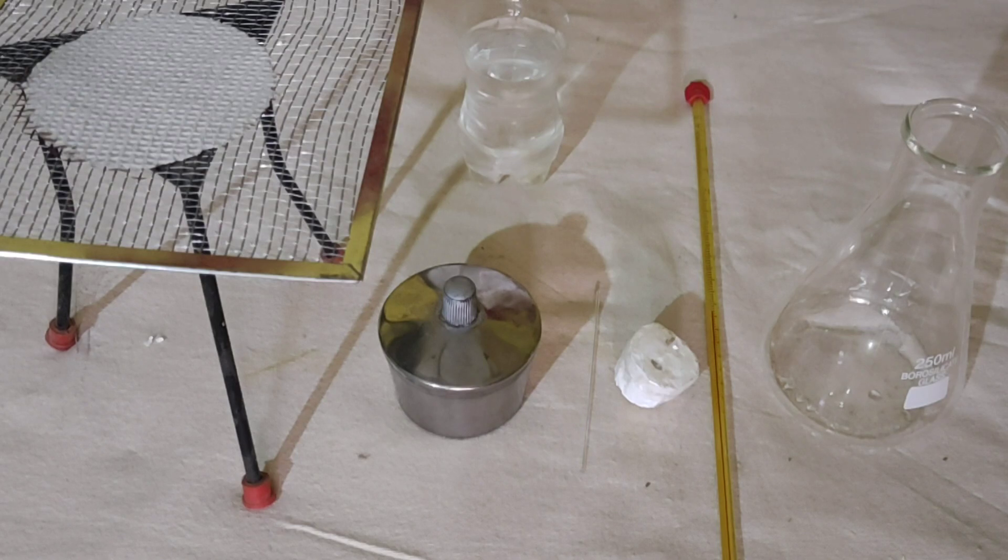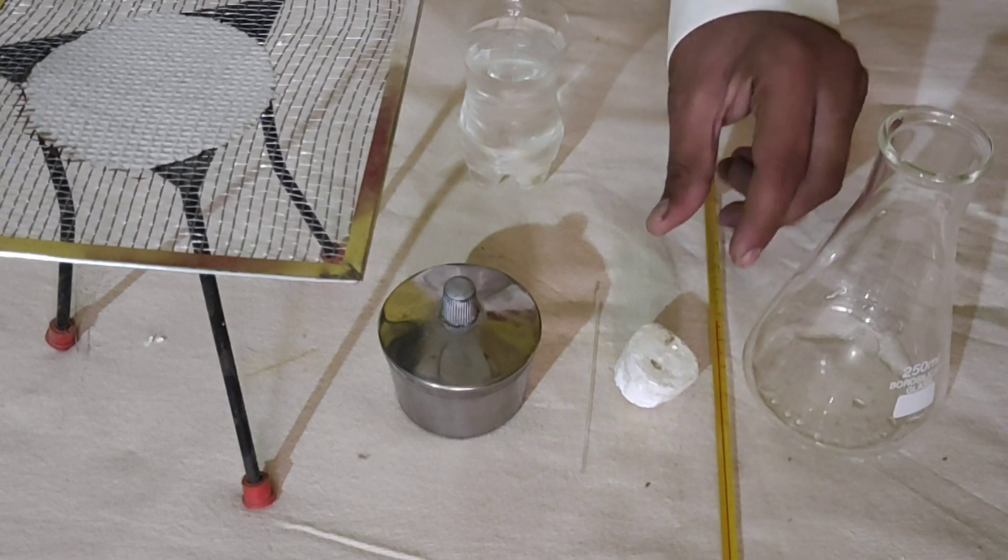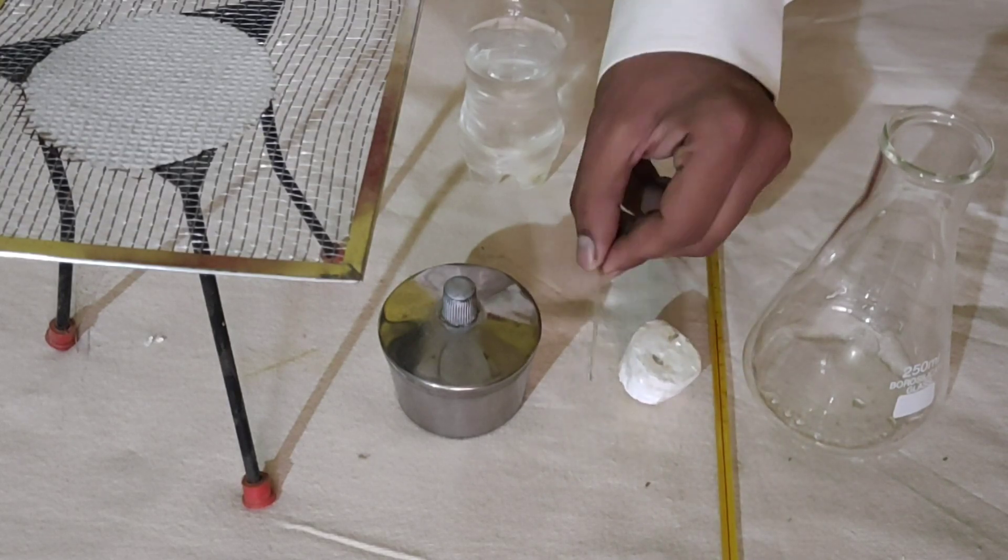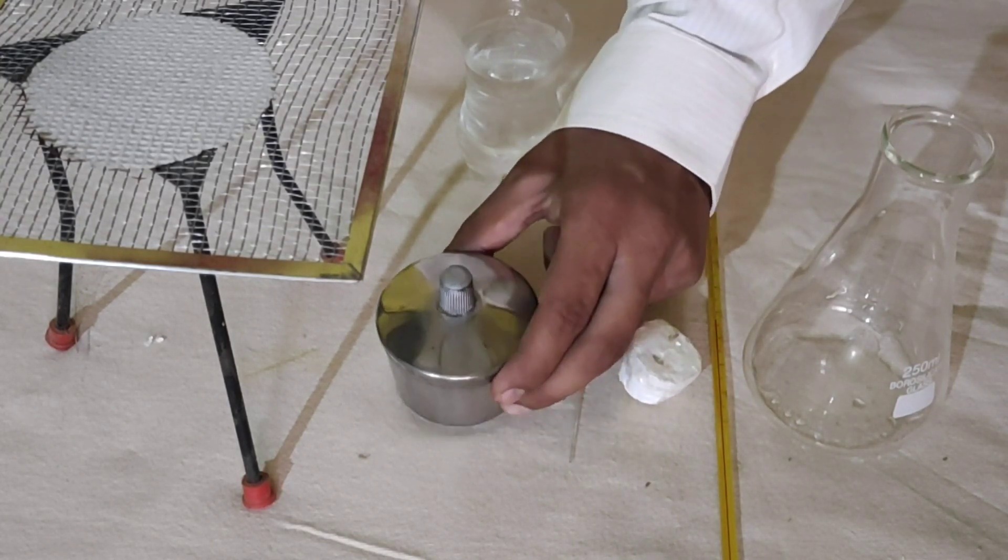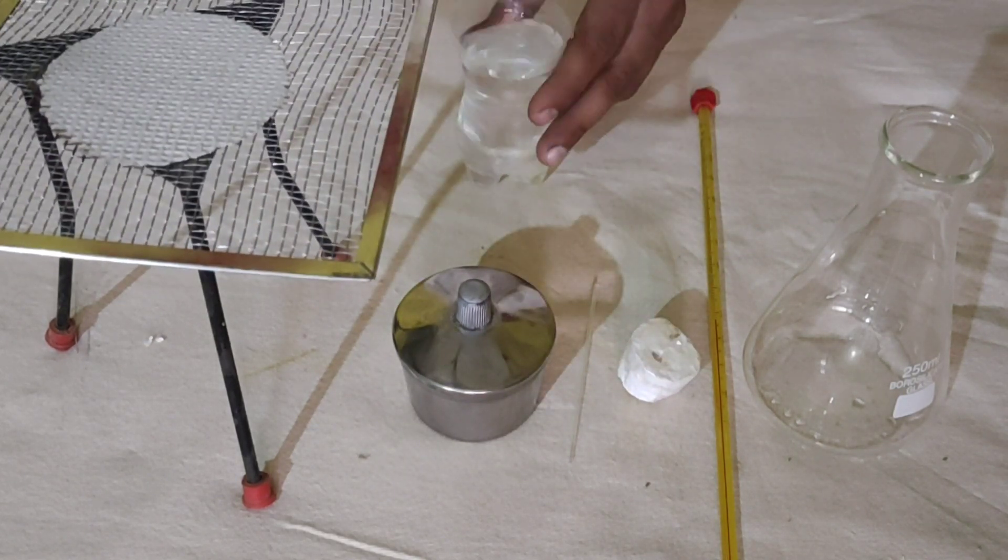For this experiment, material required: Conical Flask, Thermometer, Cork, Capillary Tube, Spirit Lamp, Tripod with Wire Gauge, and Water.